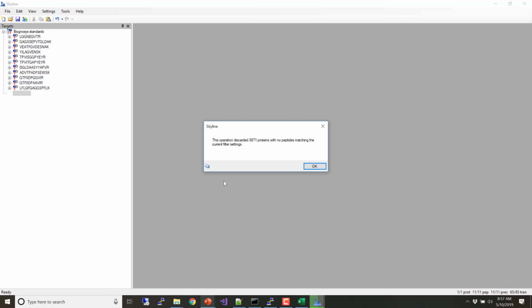But all right, so yes, do you have a question? So 8,871 proteins had no peptides, and so it's saying it's going to just discard them rather than putting a whole bunch of extra proteins into your document, which would slow things down. We're just going to not include them. And a lot of those are reverse peptides, right? So probably 6,500 or so are reversed. So click OK.